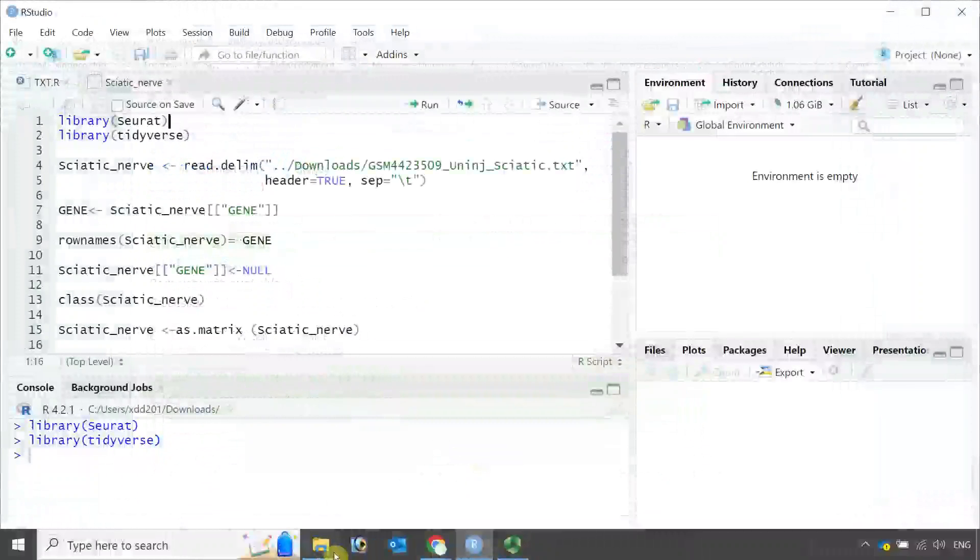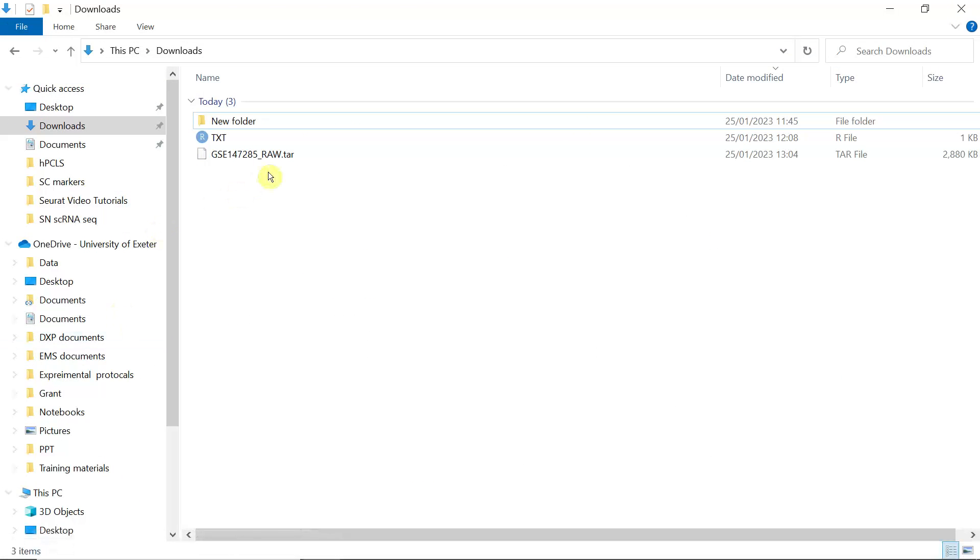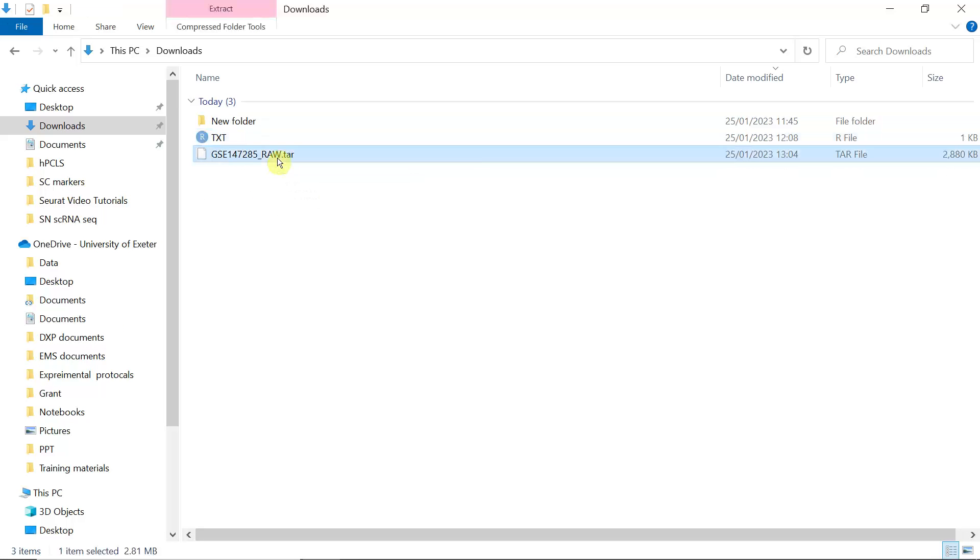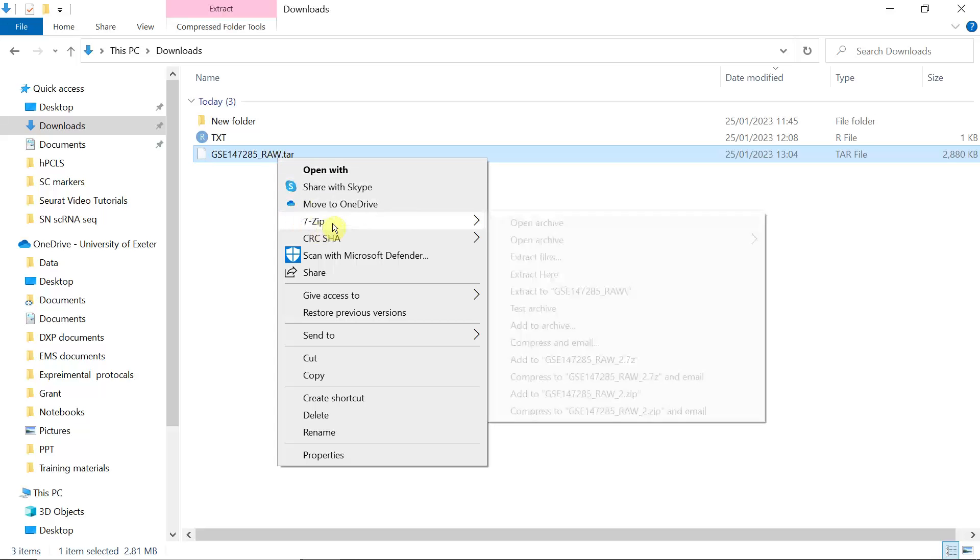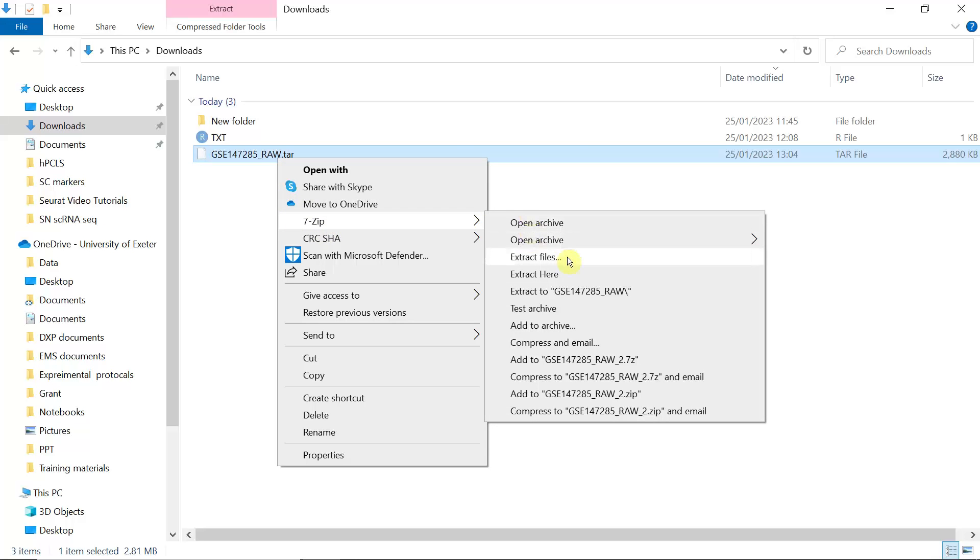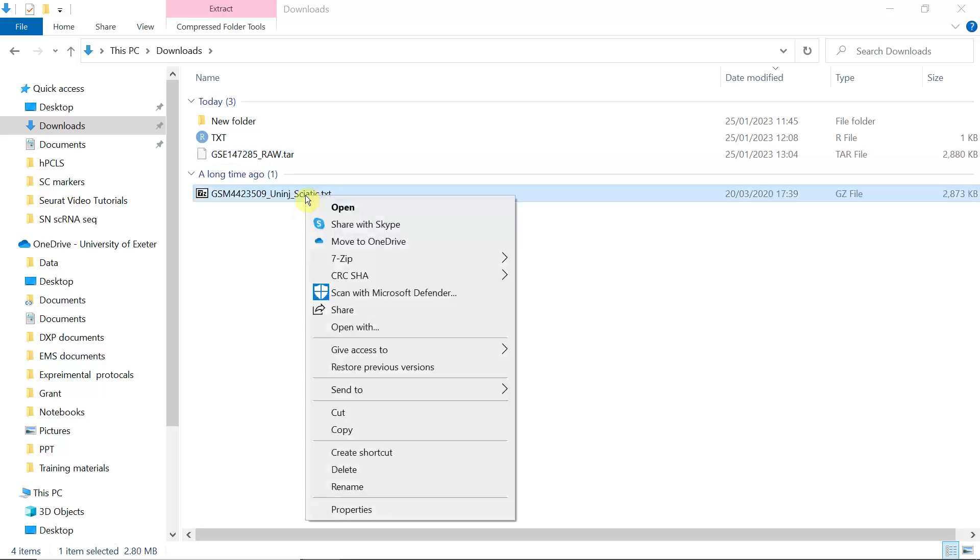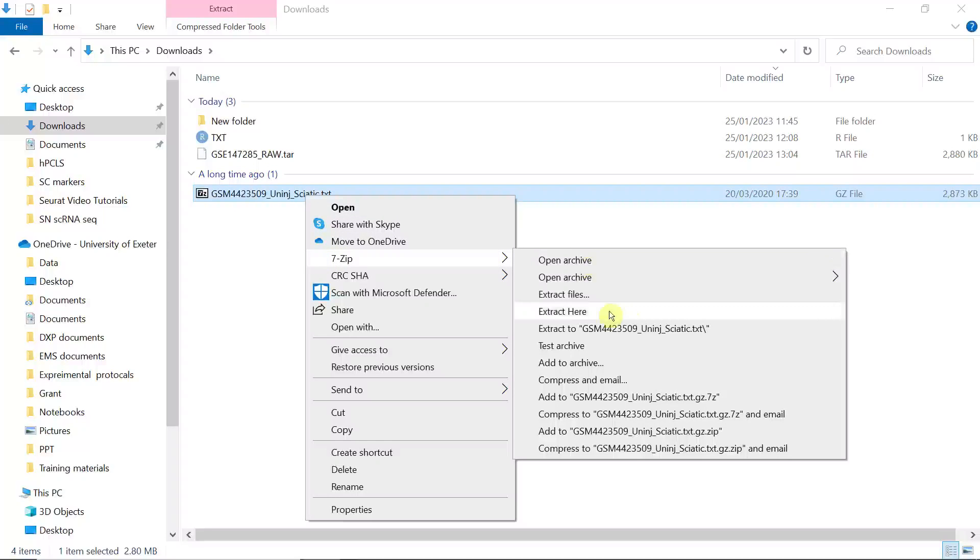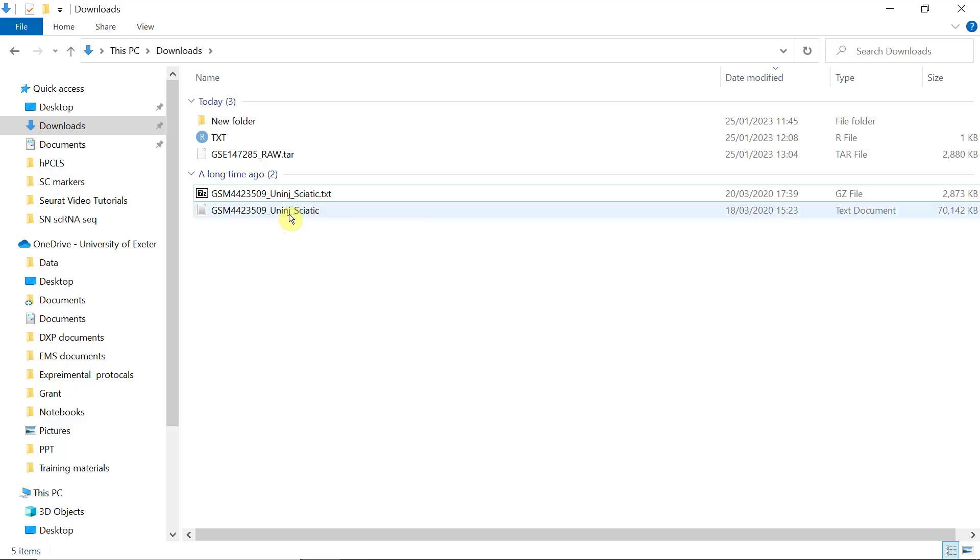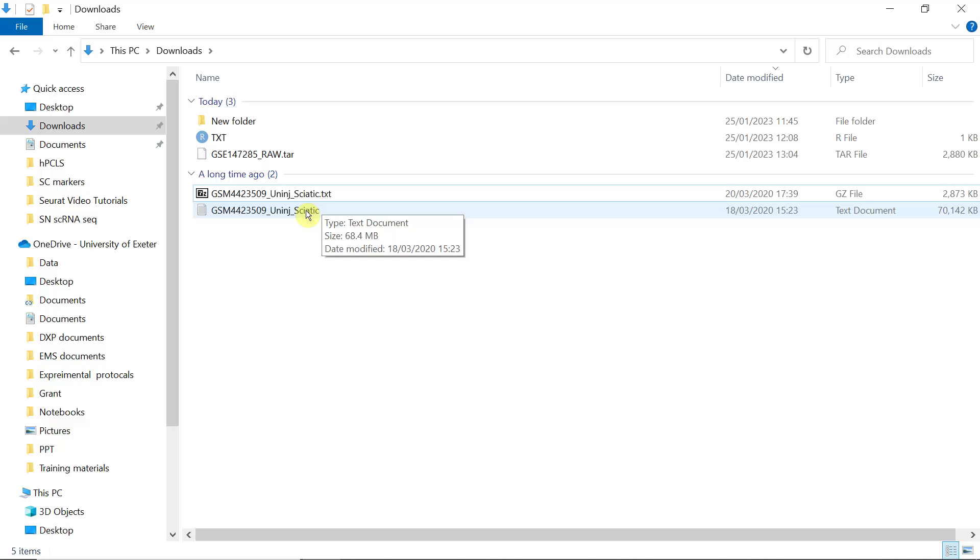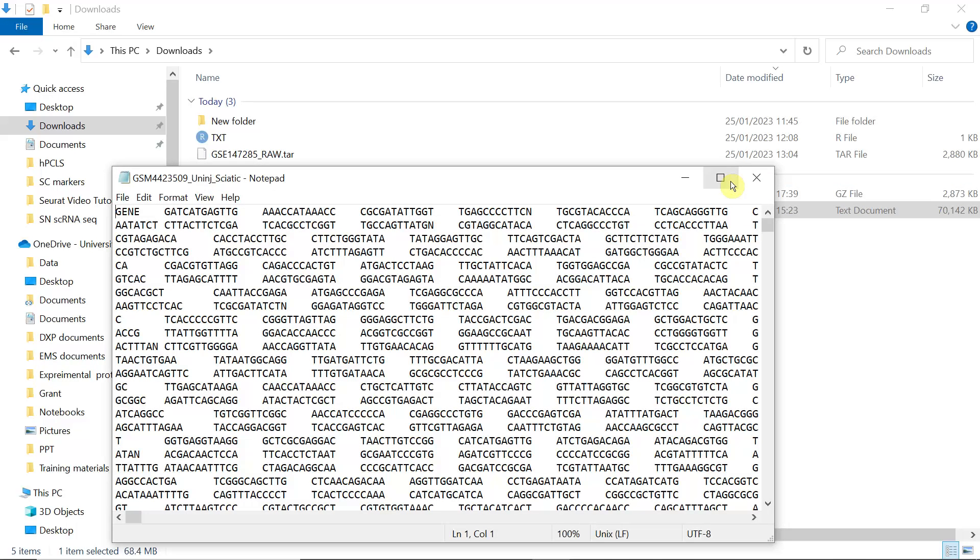We can go to the download folder. You can see the data is here. It is a compressed file, so we can unzip it. We need to unzip it again. Now you can see the data is in a txt file. We can open it.